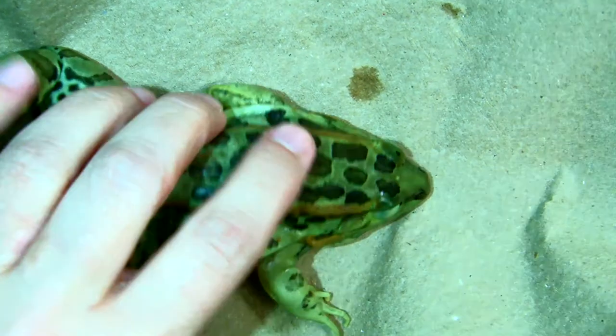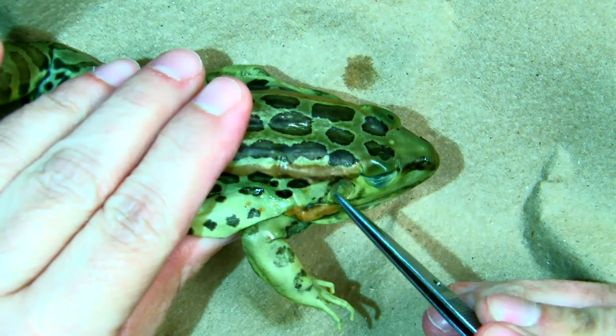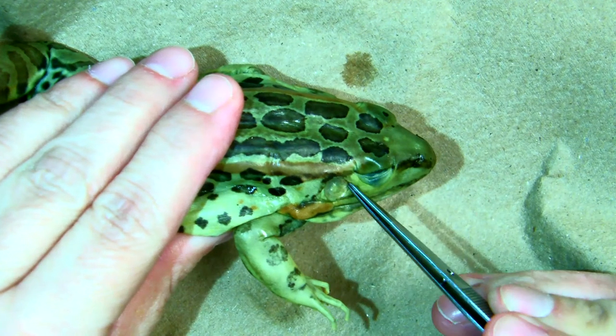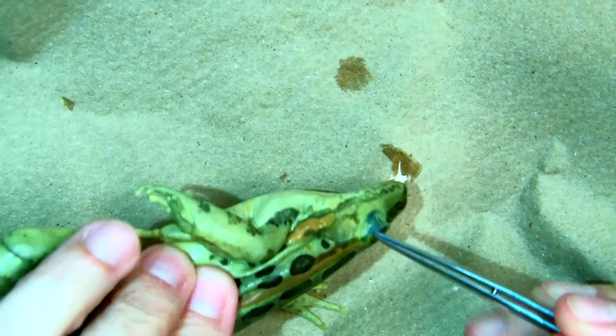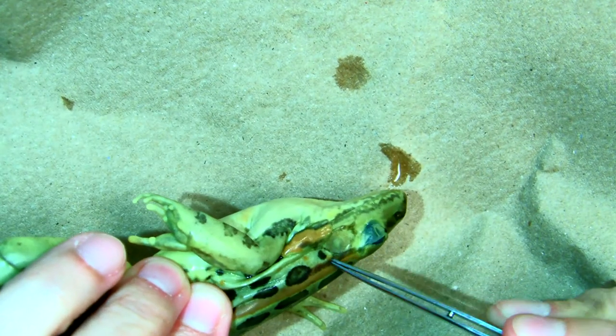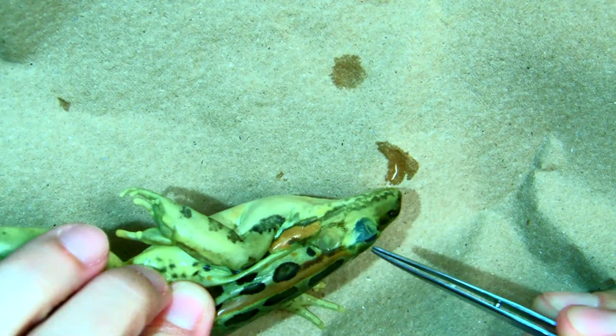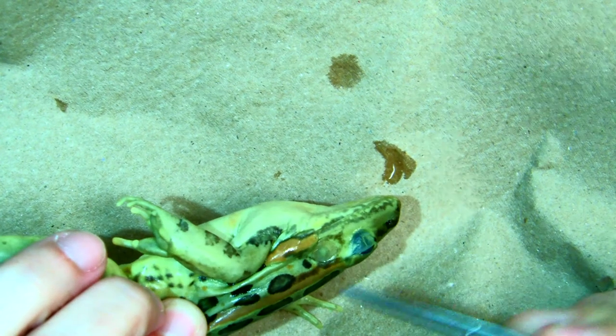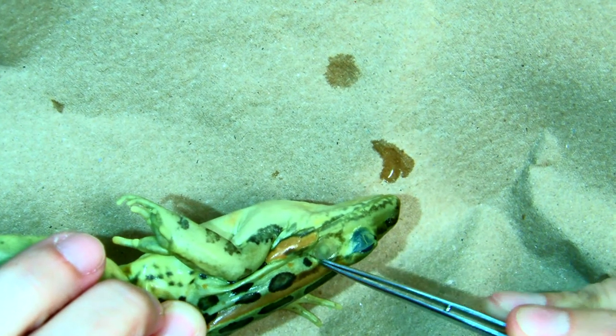We have what's called a tympanic membrane here on both sides. This is their eardrum. We have an eardrum, but it's inside our ear canal. Their eardrum is on the outside.